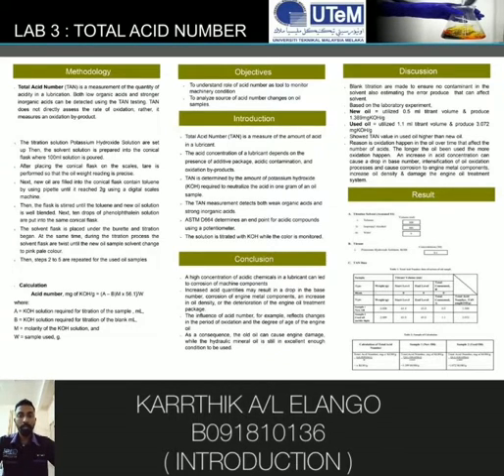To estimate the amount of additive depletion, acidic contamination, and oxidation, the total acid number (TAN) test is one of the methods used in the oil analysis field. The TAN test is beneficial to trend acid number to determine the rate of depletion of certain additives.